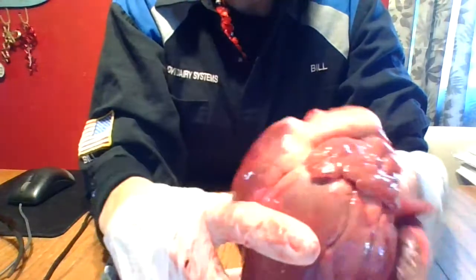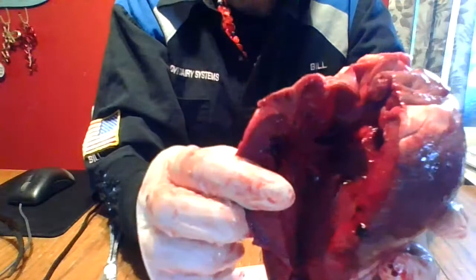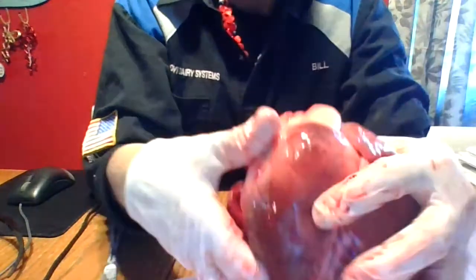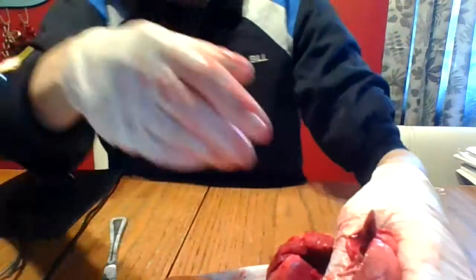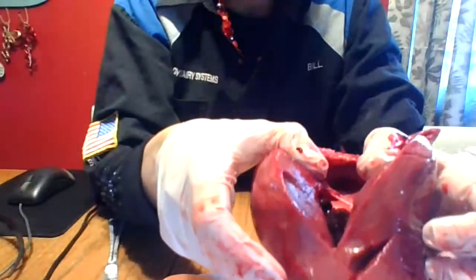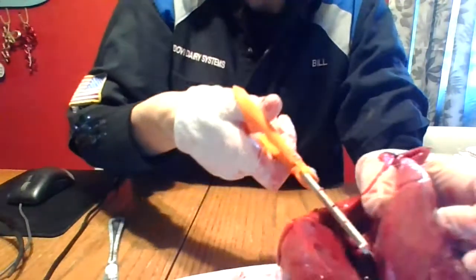It's thicker because of where each ventricle pumps blood. The right ventricle pumps blood through the pulmonary arteries to the lungs. The left ventricle pumps blood through the aorta to the whole body. So it has to be so much thicker because it pumps blood through the entire body.